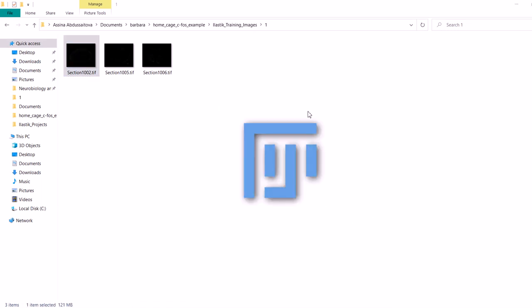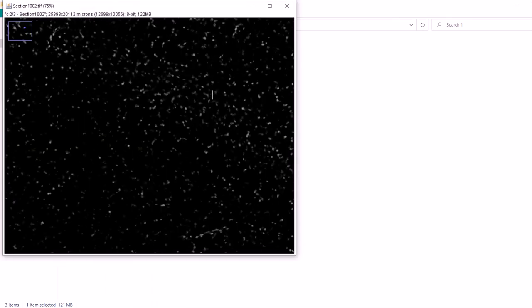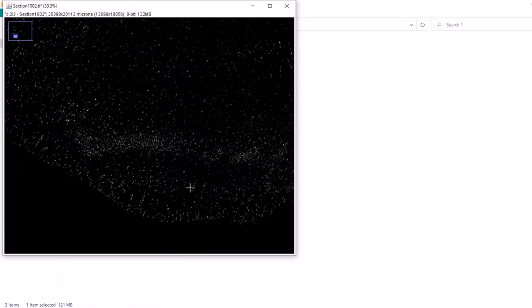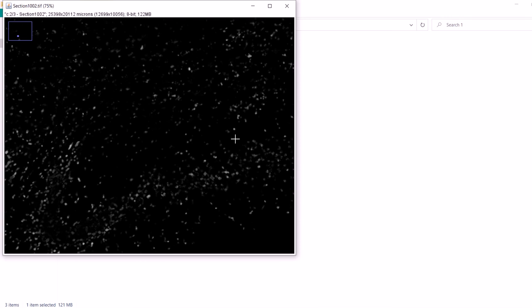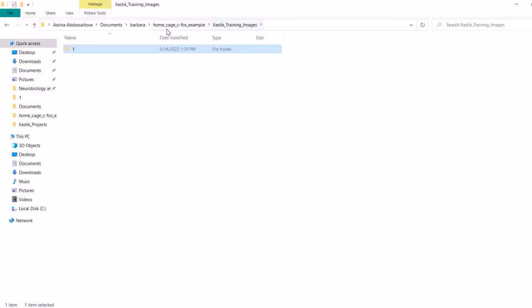So let's just take a look at them and see if it's okay. It seems quite good to me. So they subtracted the background, and I think it's pretty clear now. Okay, so this is it.